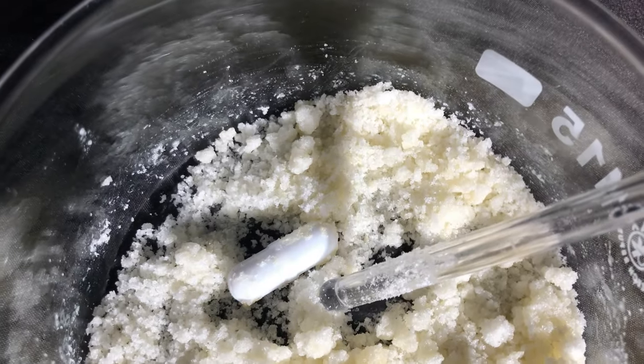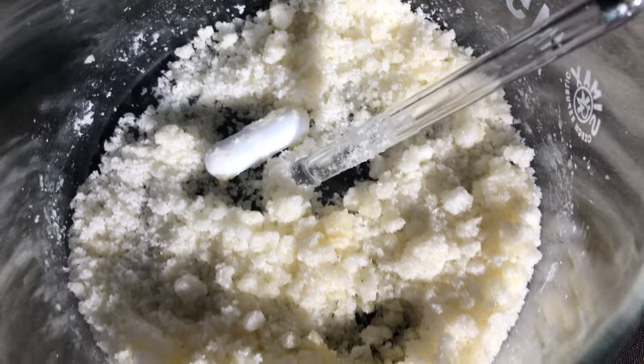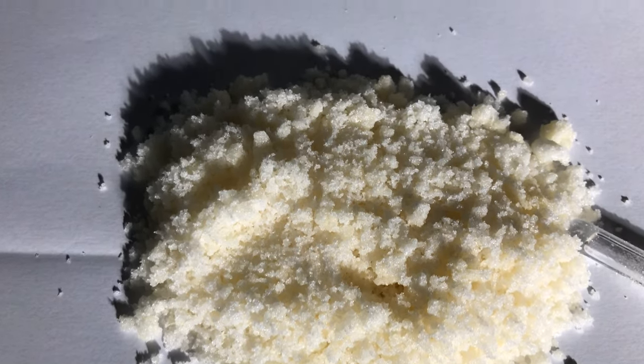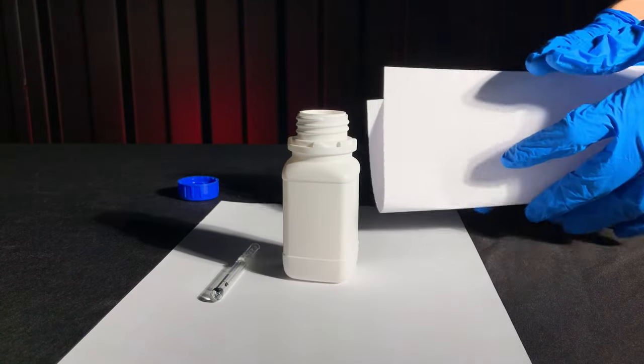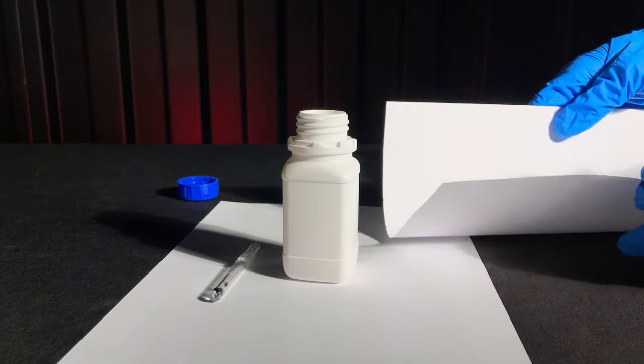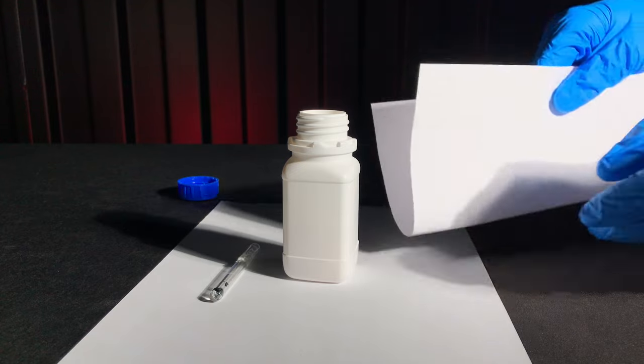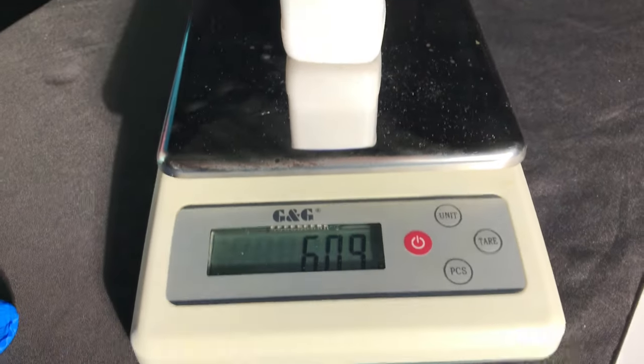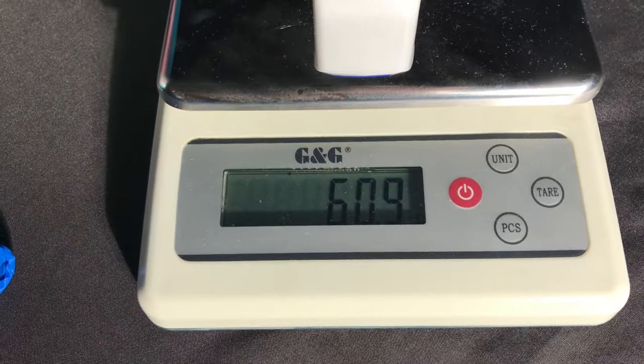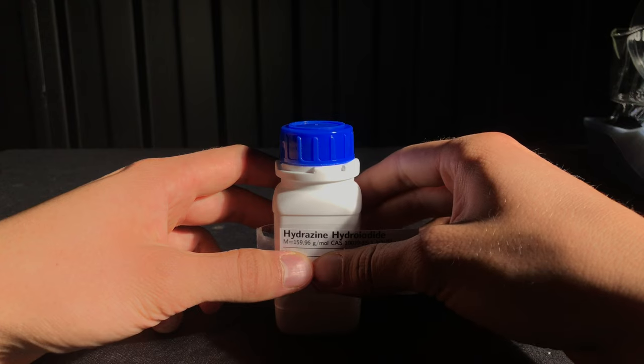In the end we were left with these beautiful, slightly yellow crystals. To determine the yield the powder was scraped onto a piece of paper and then transferred to a pre-weighed storage bottle. I always do it this way because transferring it directly from the glass dish to the bottle without spilling half of it is nearly impossible. In the end we were left with 60.9g and this represents a yield of 96.6%.